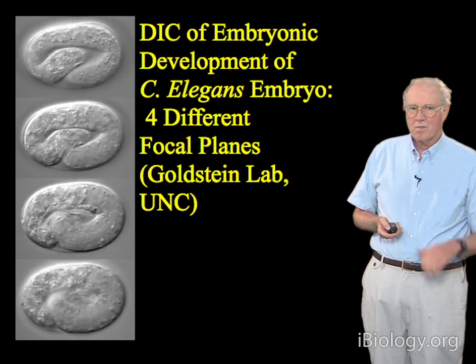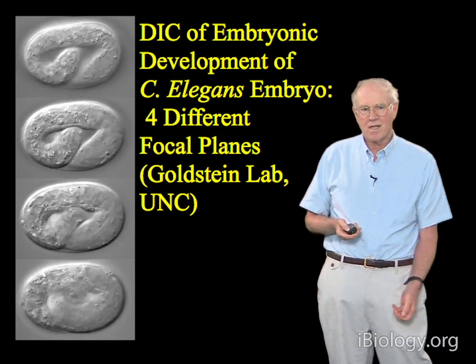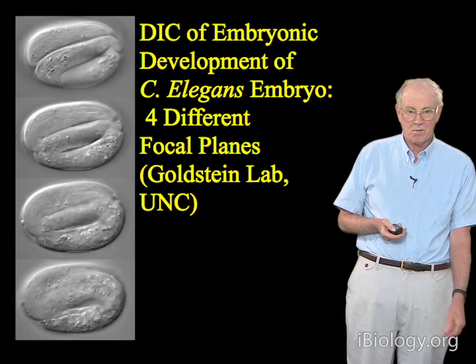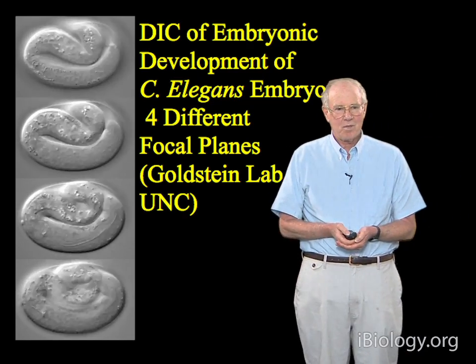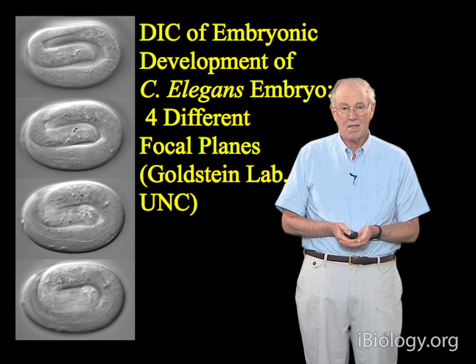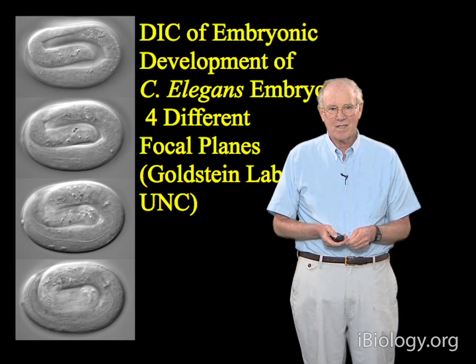All right? This would be impossible to do in fluorescence microscopy because absorption of light inevitably hurts the specimen, whereas here we do not have absorption of light. So I hope you've enjoyed these examples of these 4 modes of transmitted light imaging, and I hope you have a chance to get in the lab and give them a try.